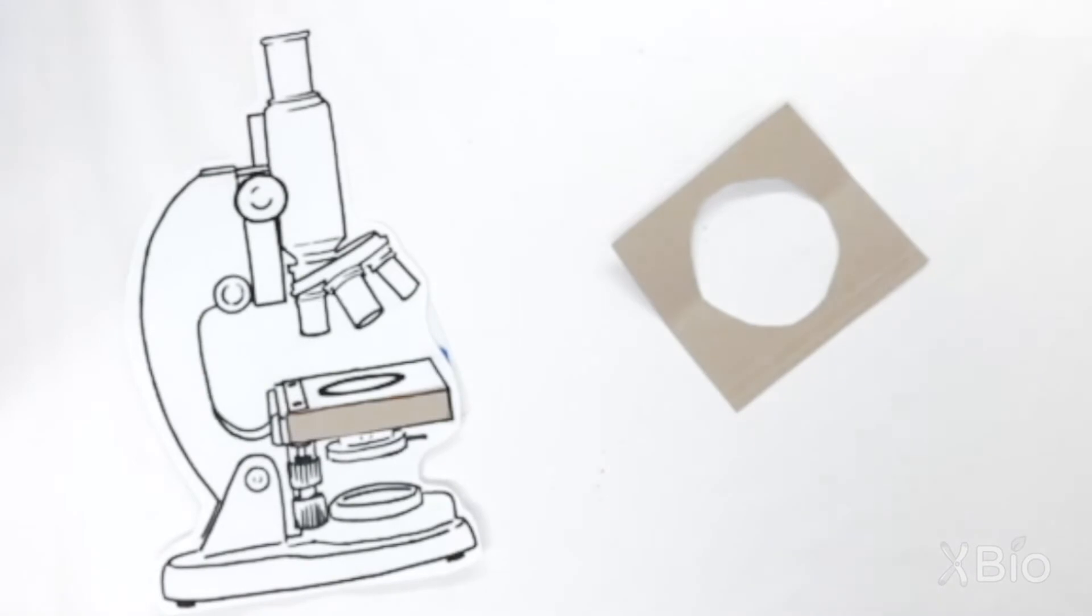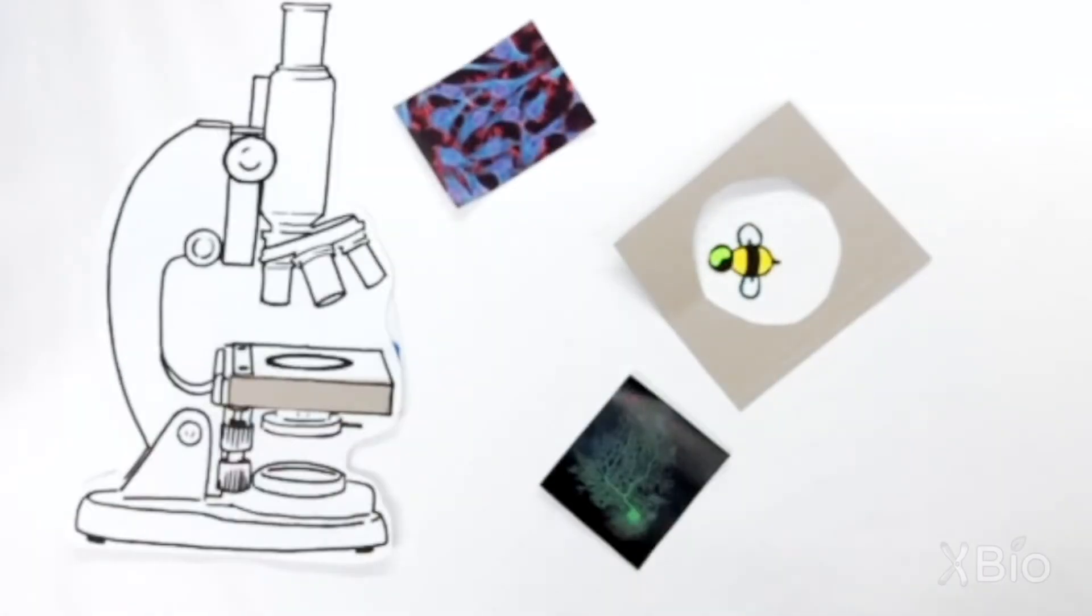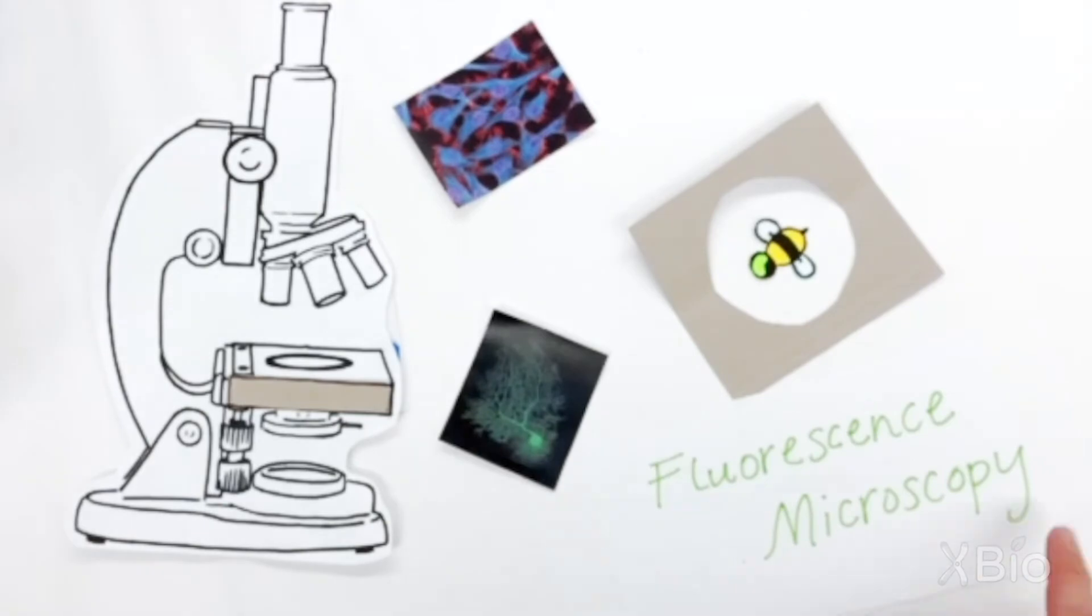By using multiple fluorescent proteins to color different parts of a sample, we can very clearly see whatever it is we might be looking for.